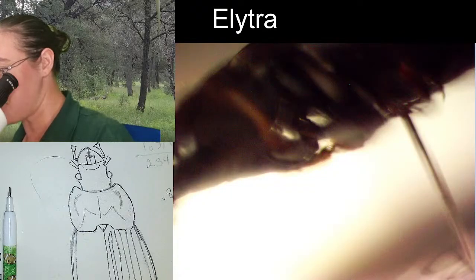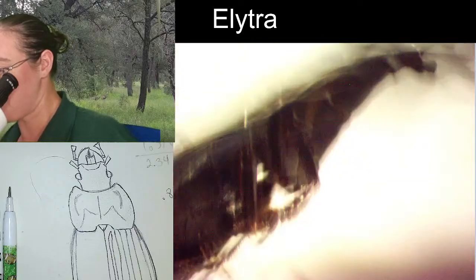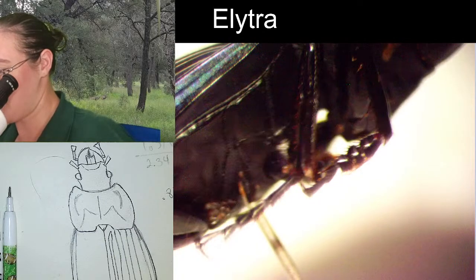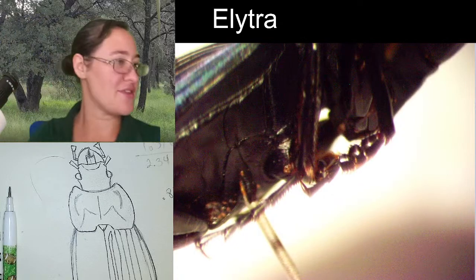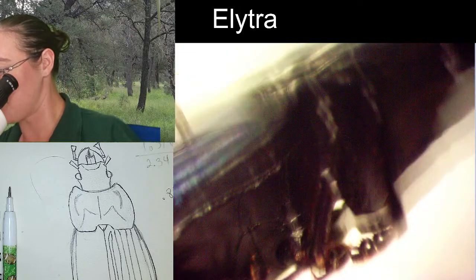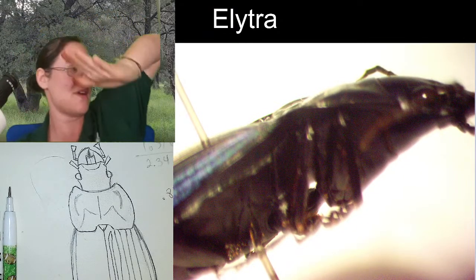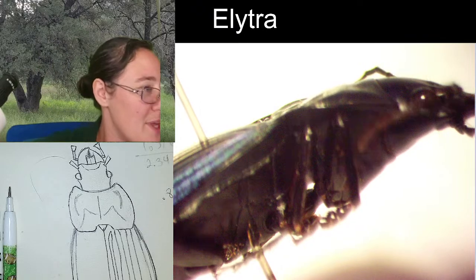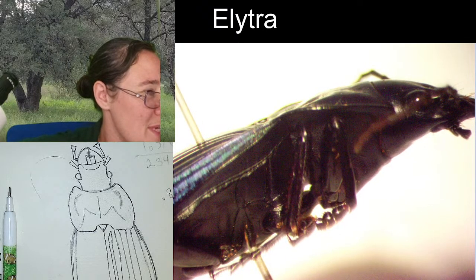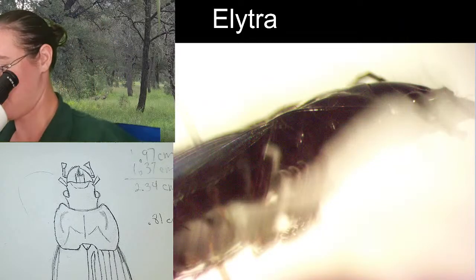So I guess I made a boo-boo when I pinned this guy, and I didn't pull the front leg forward, I let it sit backward. And this might look odd to you, and that's because the beetle is essentially trying to walk on the top of his hand rather than the bottom. His tarsal segments are flipped upside down. Oopsies. That's okay.